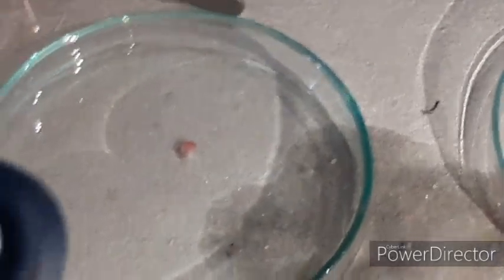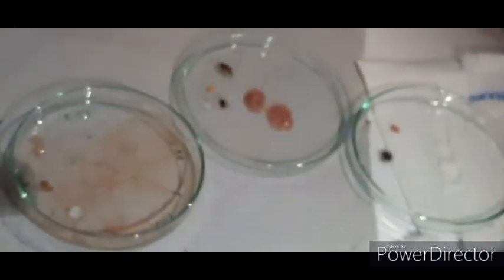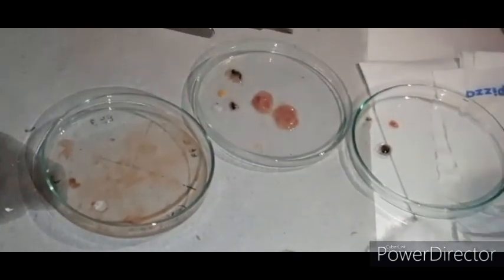Here we see the heart which is pumping when kept in phosphate buffer saline. Now, as we have separated all the organs from the chick embryo, we can use them for primary culture.